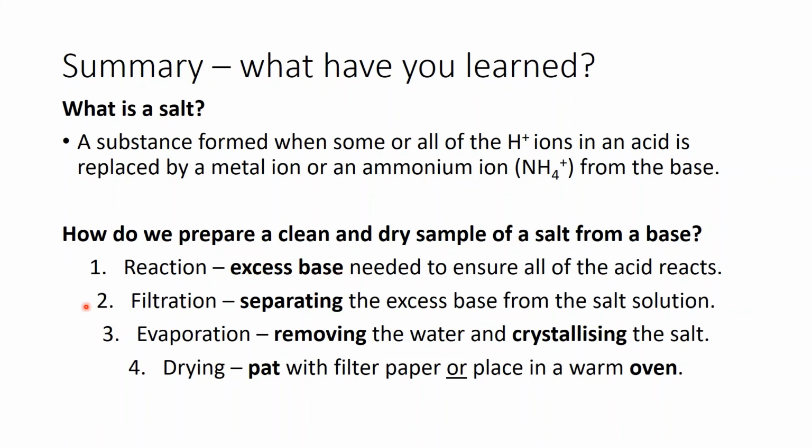Then there's filtration, which is separating your excess base from the salt solution. And finally, in the next stage, the penultimate stage, you've got evaporation, where you remove the water by crystallizing the salt over a water bath. Finally, drying. You pat it dry with a filter paper, or you can place it in a warm oven.